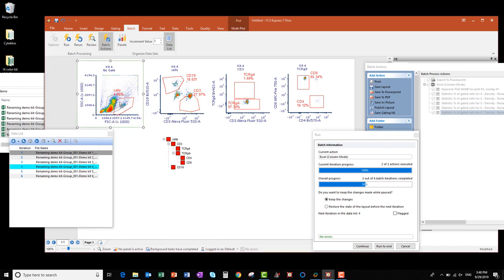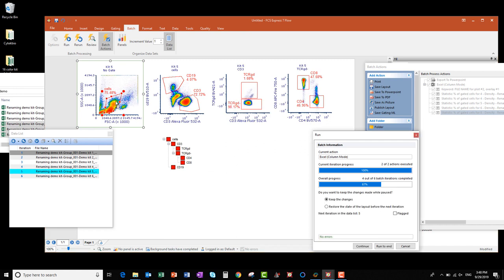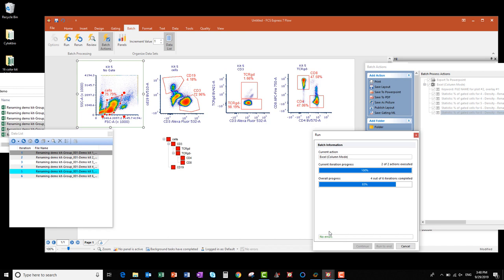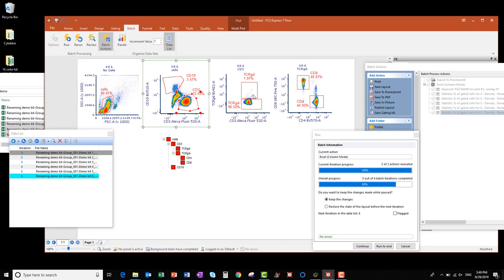For this file, my Cells gate is a little off, so I'm going to tweak that a bit. The rest look good, so let's go to the next file. Again, here my scatter gate needs some adjustment for this file as well, and I'll click Continue. And for my last file, again, adjust the scatter gate. That looks better. And I'm going to tweak the CD3 gate a little, maybe the TCR Gamma Delta gates a little, and then I'll click Continue.